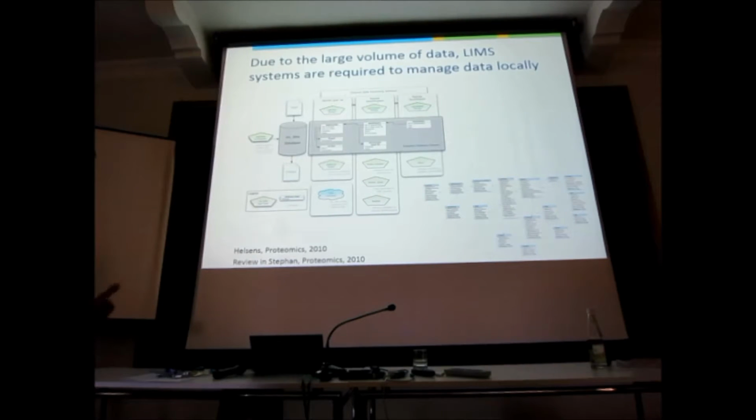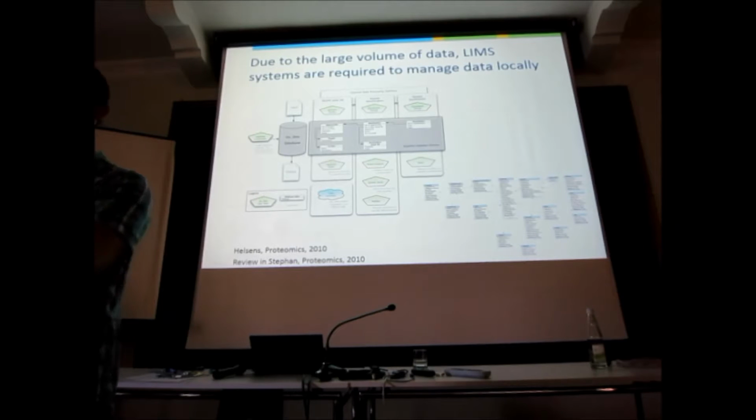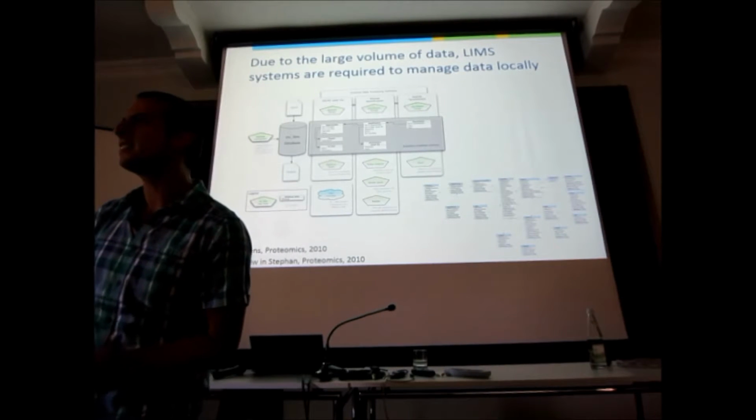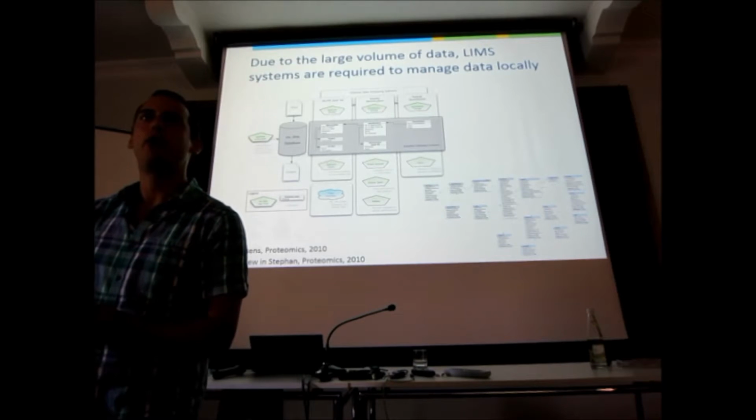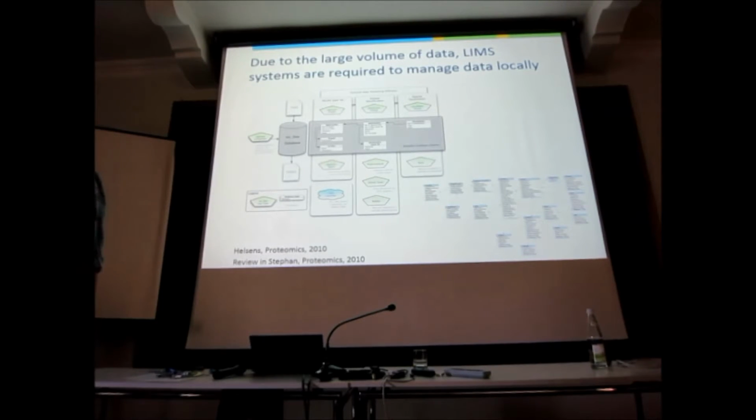So, the thing is, manage your data. How many people here know of a systematic database-driven storage of data in the mass spectrometry group they are in or they work with? So how many people store their data in a database of some sort? Yeah, I know you guys do. You guys were pioneers. I think you guys beat even me to this, which is highly unfortunate. You see, nobody does that. So step back, think about this. Does that make sense? I mean, Facebook keeps track of every photo you take, and you don't even bother taking care of your proteomics data? Does that actually make any sense?